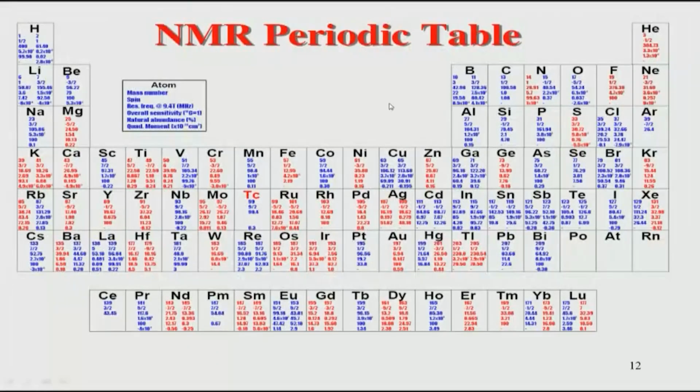As far as NMR is concerned, only that 1% contributes to the signal; the remaining 99% is blind or transparent to NMR because it has spin 0. So, you can see the sensitivity is low, because out of 100 carbon atoms, only 1 will be 13C. Similarly, the abundance will vary for different nuclei, and based on that the sensitivity is determined.